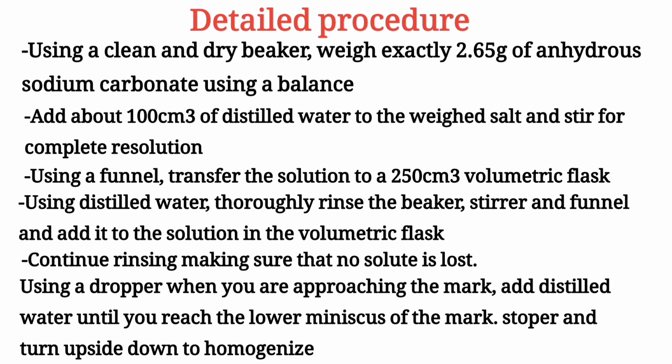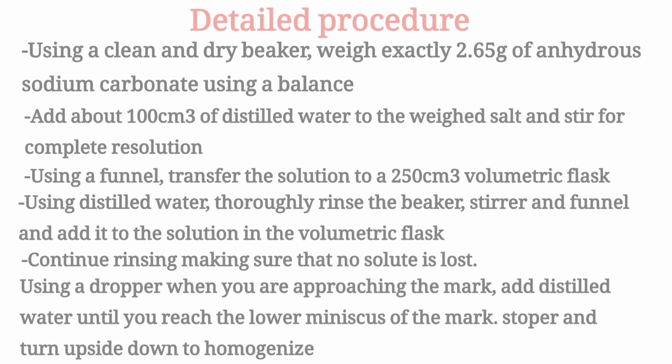Hooray! Congratulations! You have prepared your standard solution of 0.1 molar in a 250 cm cube volumetric flask. Now we await titration. In our next class, we are going to use our prepared standard solution to carry out titration. You have assignments at the end of this video to do. Make sure you do your assignments. That's when I will evaluate to really know if you have mastered the concept.